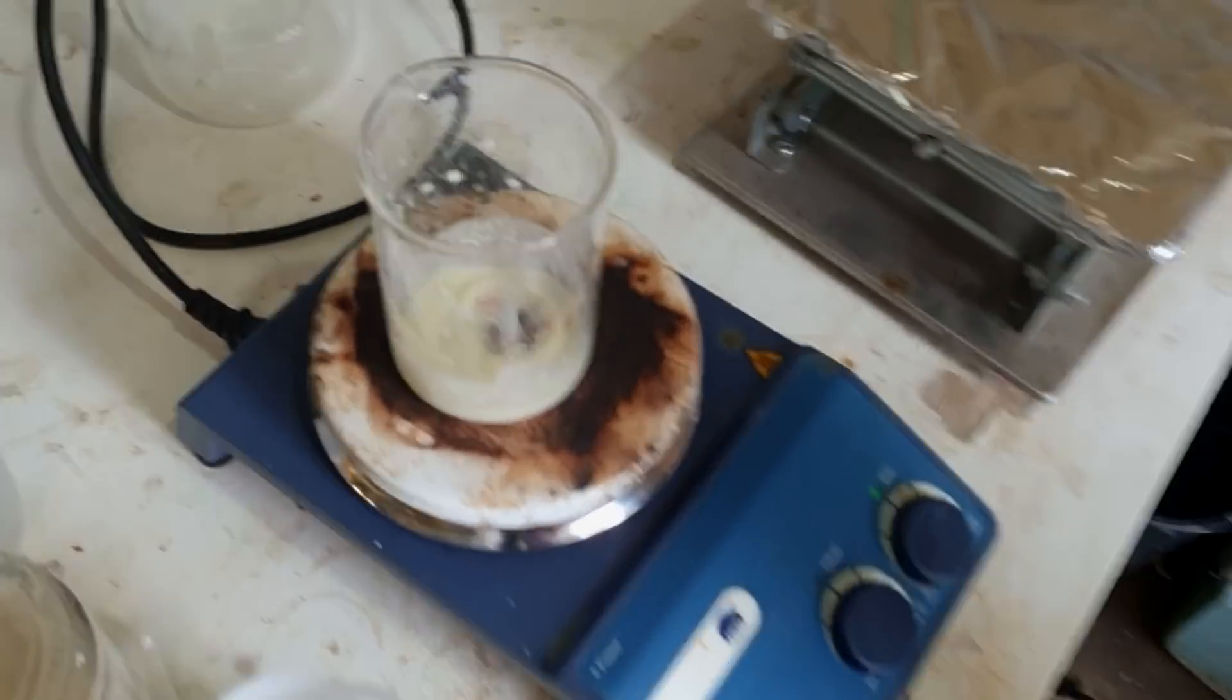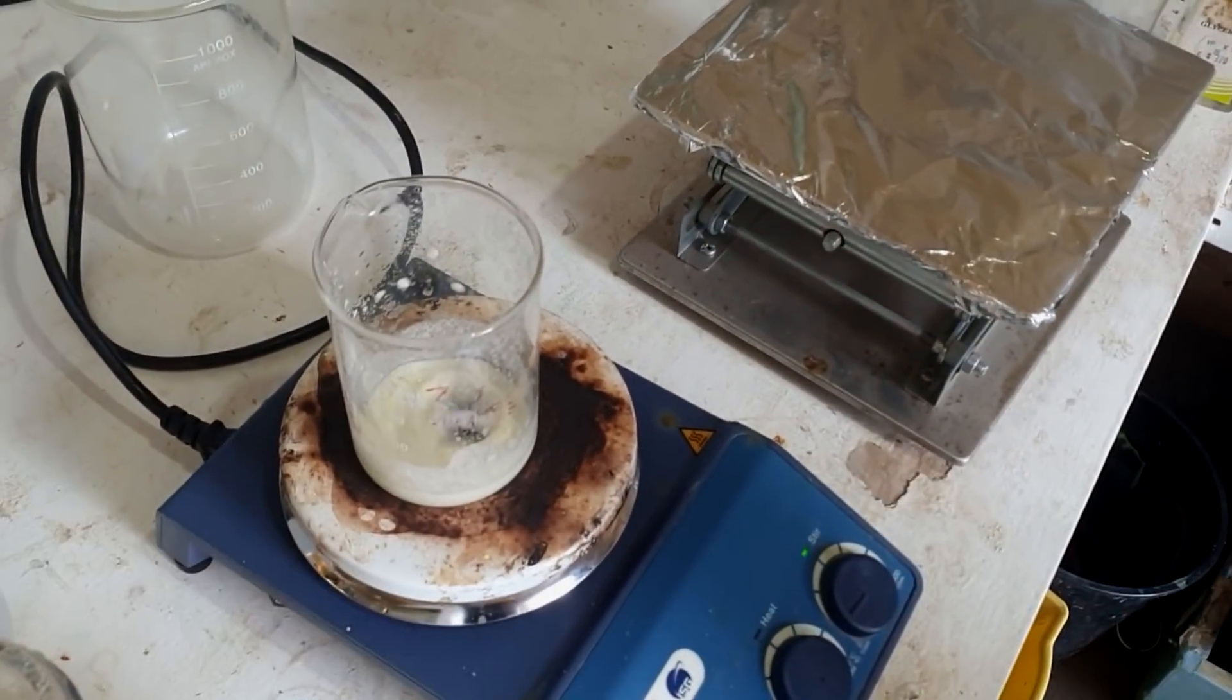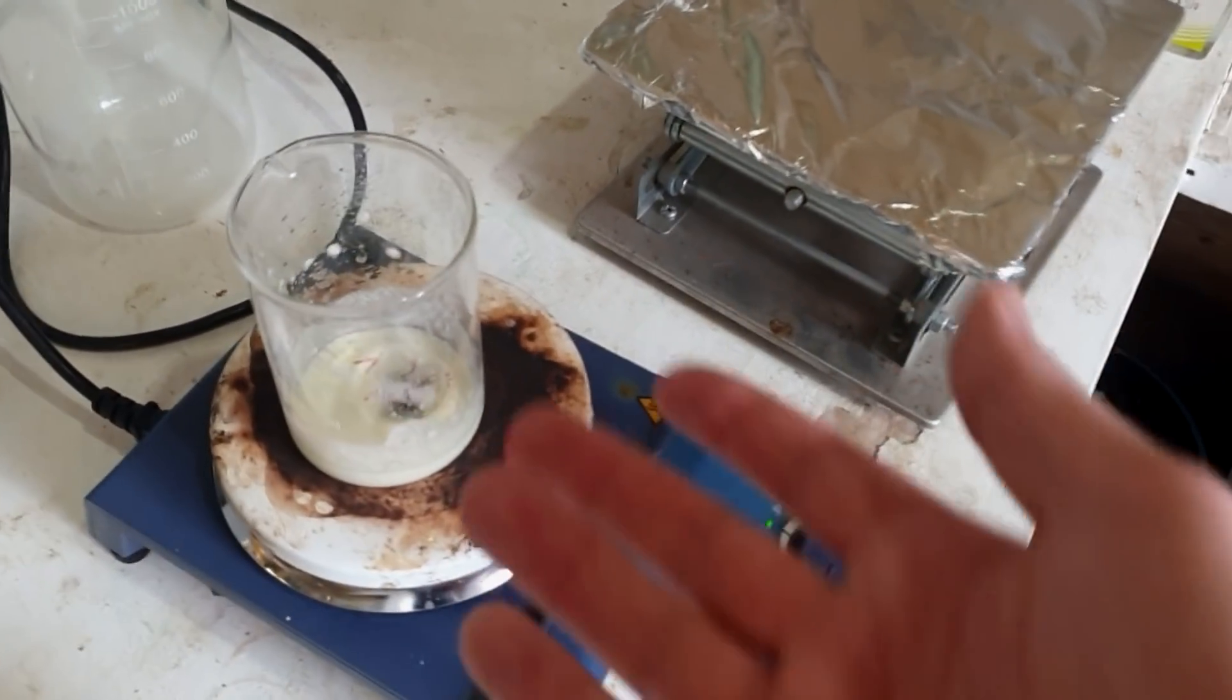Rather than getting every single last crystal out and fusing it to the bottom of the glassware, which will be a real pain to get out, I'm going to suspend it in some acetone. It shouldn't dissolve very much at all in acetone, and it should let us get a suspension that is filterable. It might even wash some of that yellow color off, who knows.